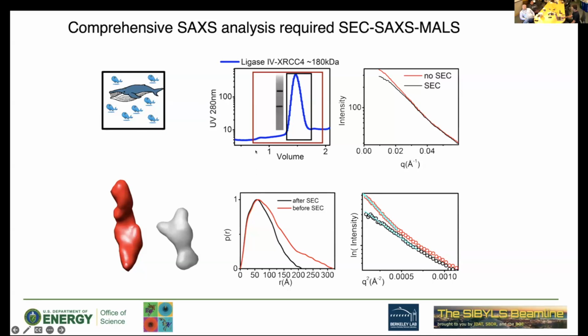Yeah. Some people are really looking at aggregates and don't care. And I'll show some examples when the complex state is much more complex and they really don't care about the monodisperse, or I would say the single species, rather they are just looking at this larger stuff. I have seen projects where they're really focusing on the aggregates right at the first.